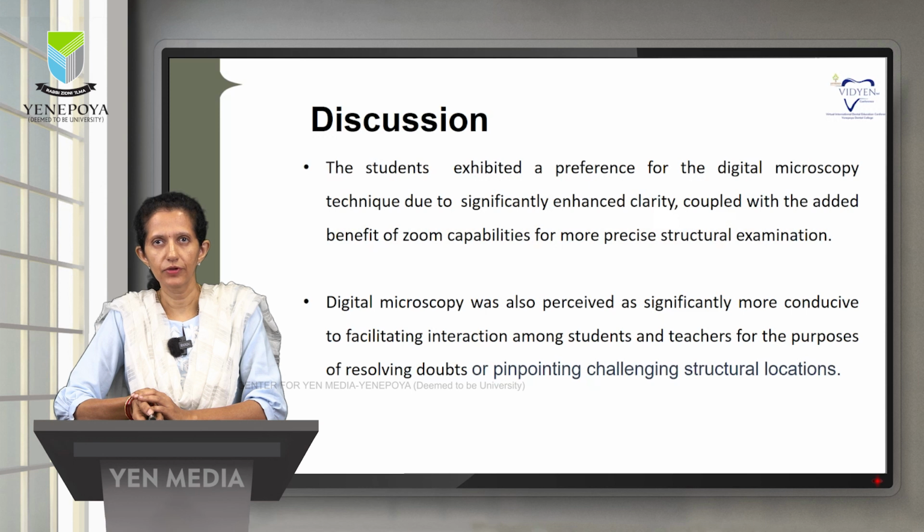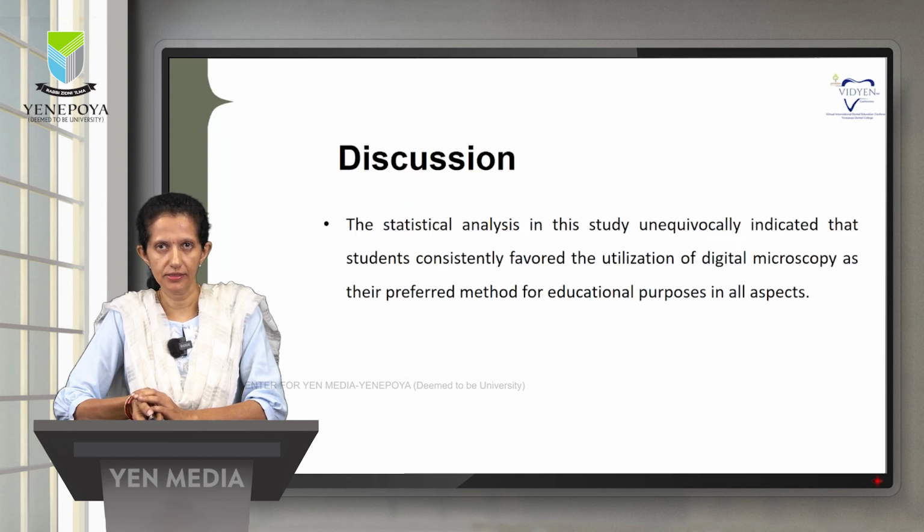The students exhibited a preference for the digital microscopy technique due to significantly enhanced clarity coupled with the added benefit of zoom capabilities for more precise structural examination. Digital microscopy was also perceived as significantly more conducive to facilitating interaction among students and teachers for the purpose of resolving doubts or pinpointing challenging structural locations. The statistical analysis in this study unequivocally indicated that students consistently favored the utilization of digital microscopy as their preferred method for educational purposes in all aspects.